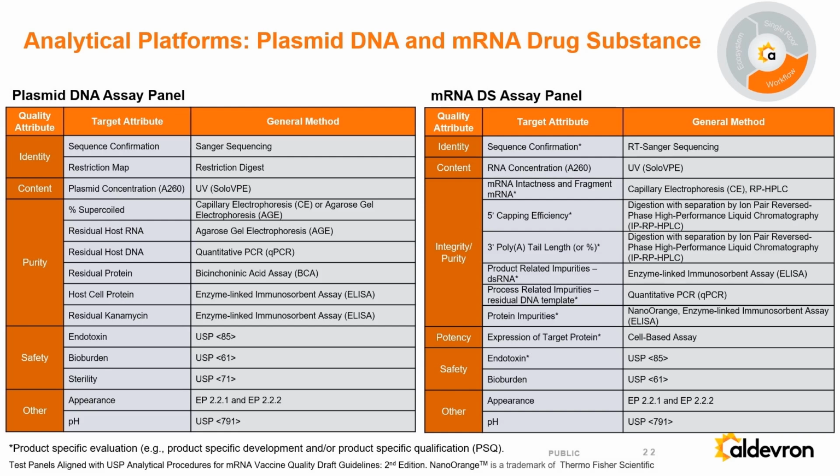And so we've revamped our mRNA drug substance assay panel to be more aligned with the recommendations in that particular document.